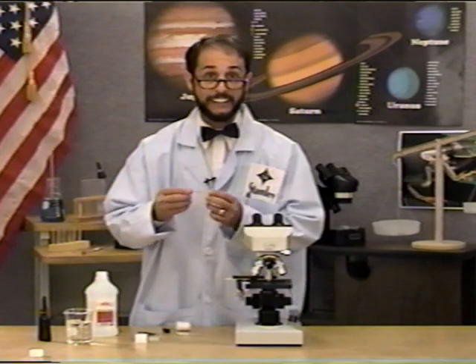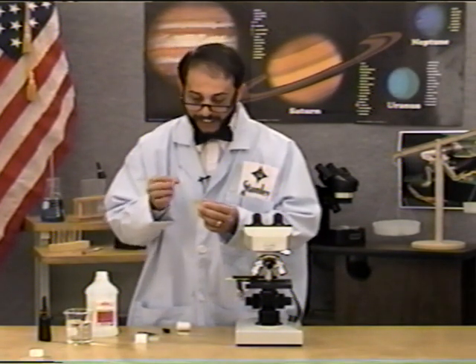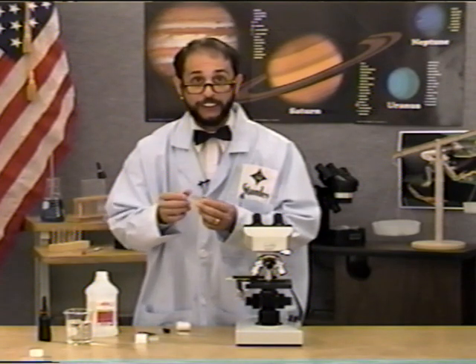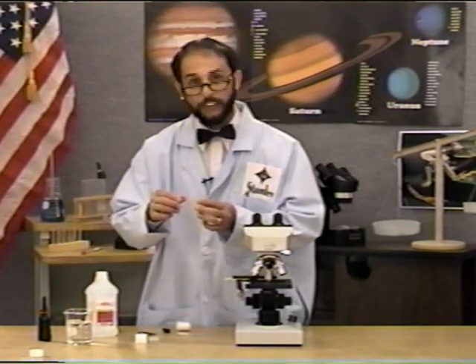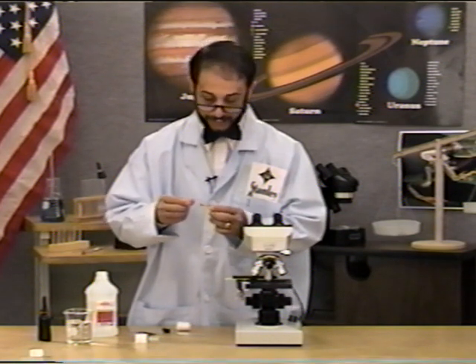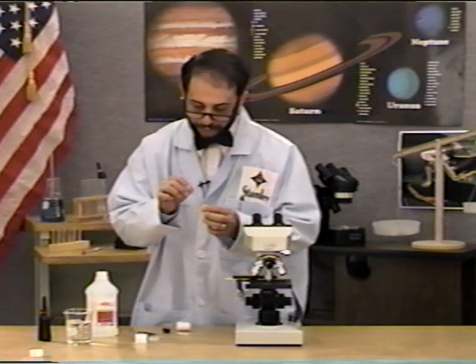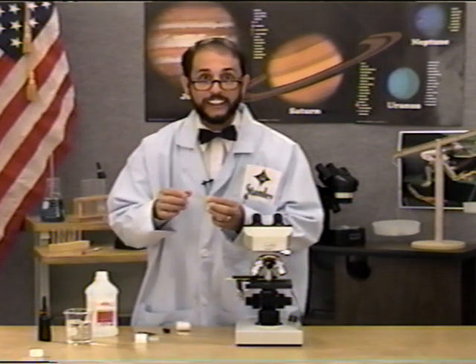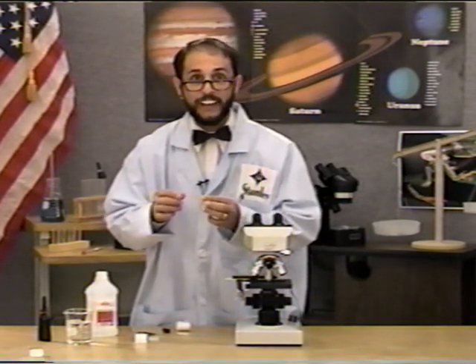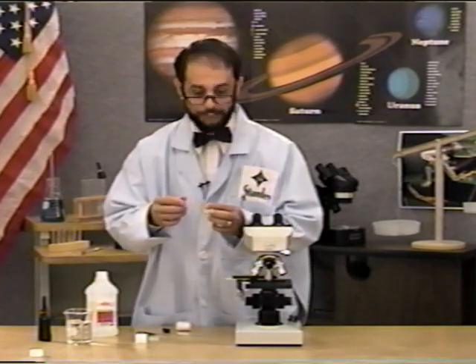Here's a slide that's already dry. To that, we're going to add now a few drops of water to rinse things off, and we'll let that dry off. Here's one that's been stained and rinsed and dried. We'll give it just a little more water, a few more drops, to make sure it's clean. Then we'll let that dry a little and look at it under the microscope.